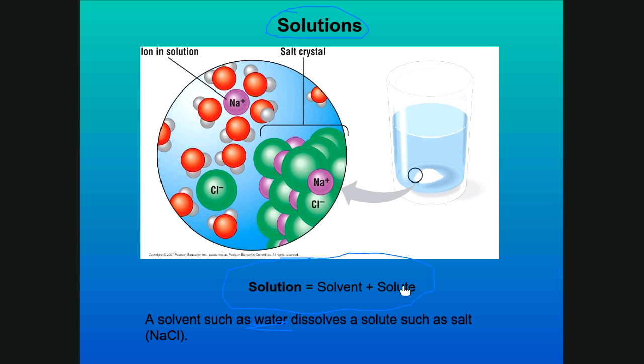So here, showing a saline solution or salt solution being created by adding a teaspoon of salt. Polar water molecules are able to break the ionic bonds, creating this saline or salt solution, okay?